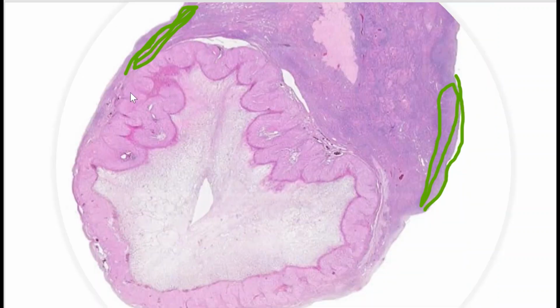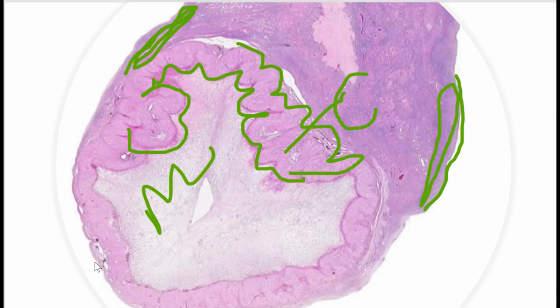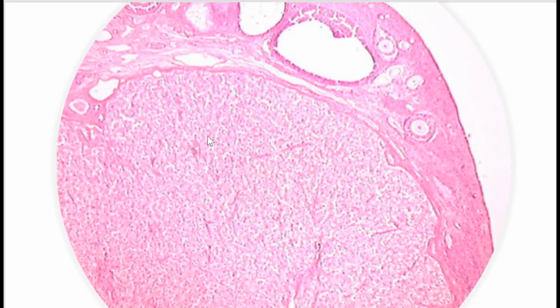So here's another picture of this luteum. And luteum, in this stage of it, is kind of like a squiggly outer layer here, which would be considered your cortex. This area and here would be your medulla. But the whole thing is your corpus luteum. Here's another image of the corpus luteum. It's just different stages.